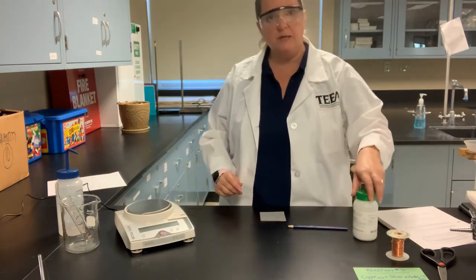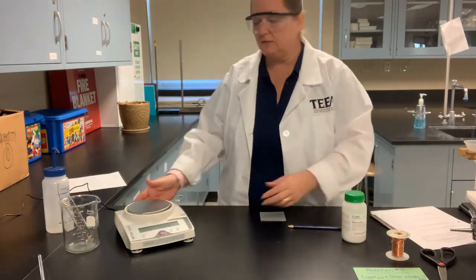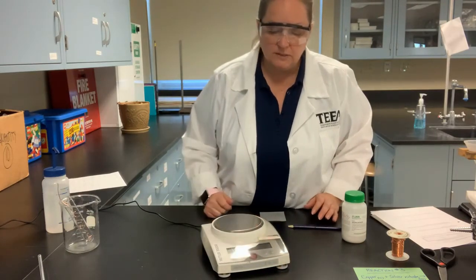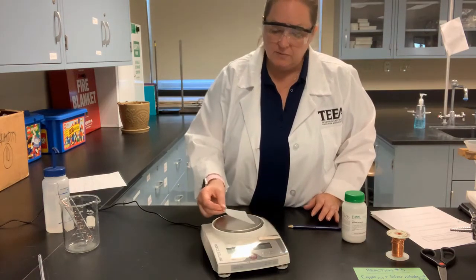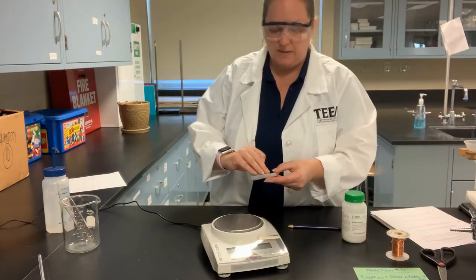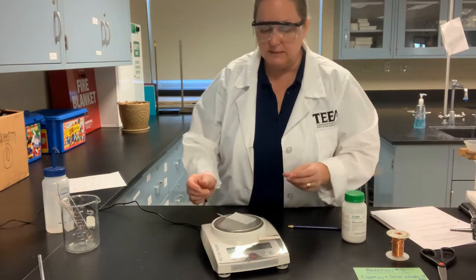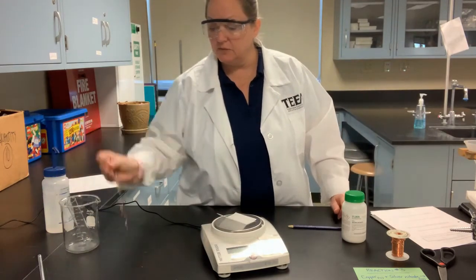And step 2 is going to be to measure out my silver nitrate in order to create my silver nitrate solution. So I have an electronic balance here, and step 1 is we want to zero the balance and make sure that we've zeroed it out before we begin. And then I'm going to place a small piece of paper on the balance, which is called a piece of weighing paper. And before I do that, I'm going to put a little crease in it to make it a little easier to add that silver nitrate to the test tube once I've measured it out.